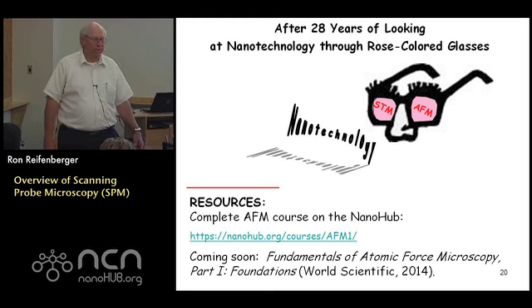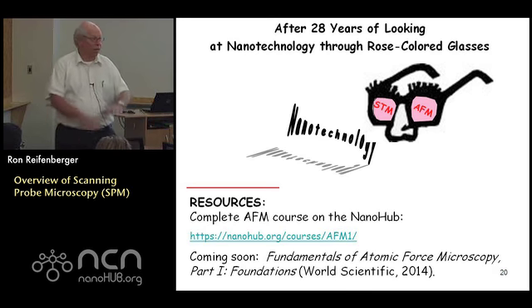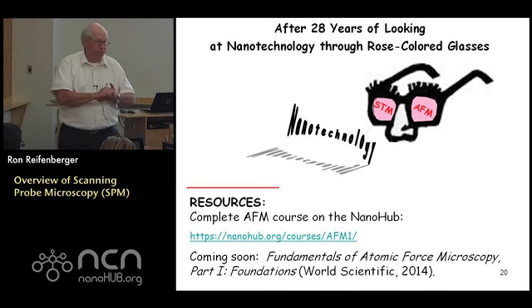It's pretty challenging work, right? So I don't want to give you the impression that every AFM sees atoms, right? If you want to see atoms with an AFM, you've got to work at it. You have to have a research program that's focused on that goal. But routine characterization of samples, that's here, right? Any commercial instrument you buy nowadays or any instrument that you might find in your research labs would be able to do routine characterization.